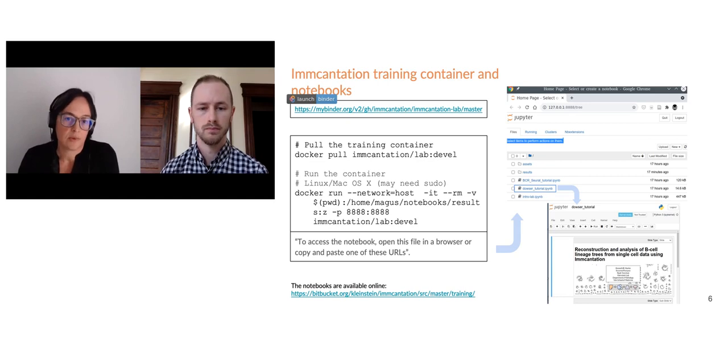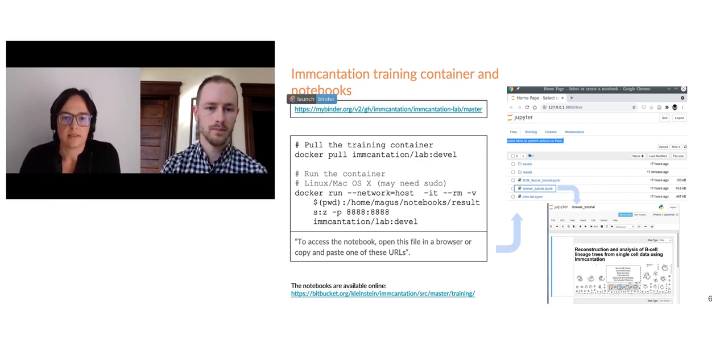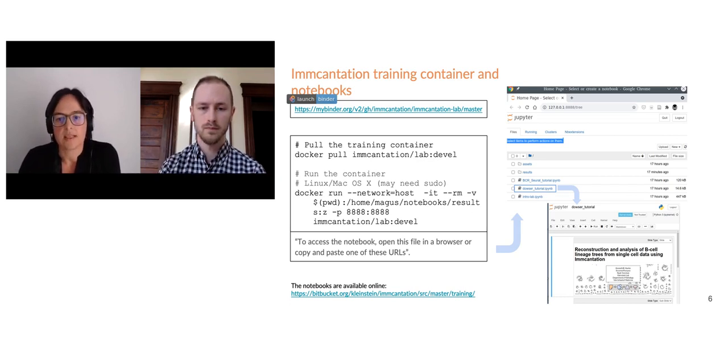And this is the most important slide for today's session. You should have received already an email with these instructions, and I believe we sent that email yesterday. You can also check the chat, because I think you will find the link posted there later. The easiest recommended way to follow along with today's tutorial is to use a Binder, which is a website that we have prepared with a training container that has example data and a Jupyter notebook with all the commands that Ken is going to be using today.